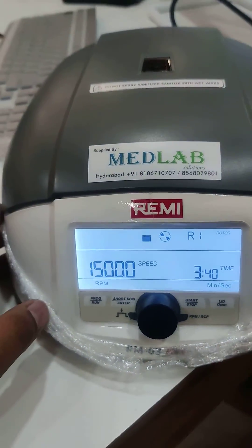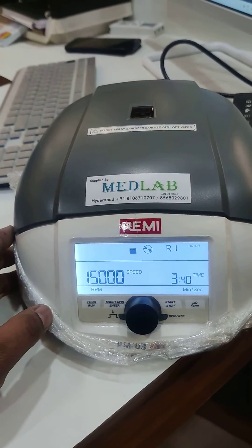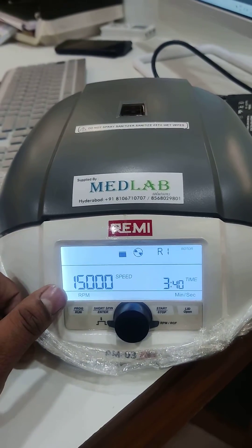Today we are demonstrating the settings of the RM03 plus mini centrifuge, which goes up to 15,000 RPM.